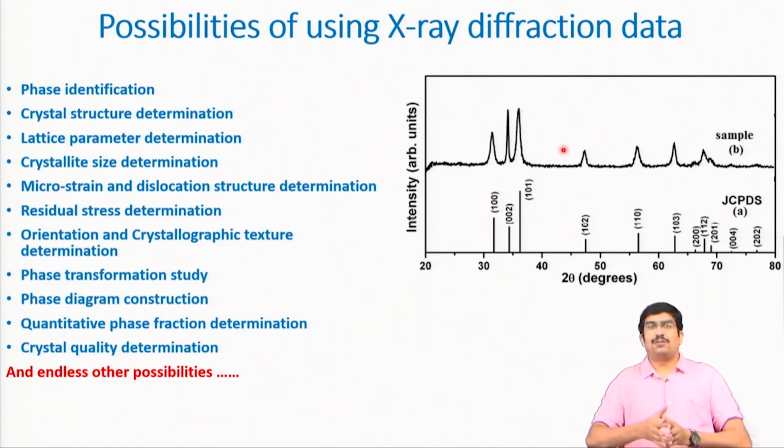You can also use it for crystal quality determination. If you are developing a single crystal, you can take an X-ray diffraction and find out how much order there is, or what imperfections there are in your crystal, and so on. And there are endless other possibilities where you can use this X-ray diffraction data.